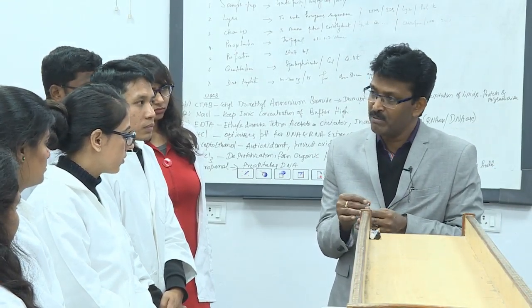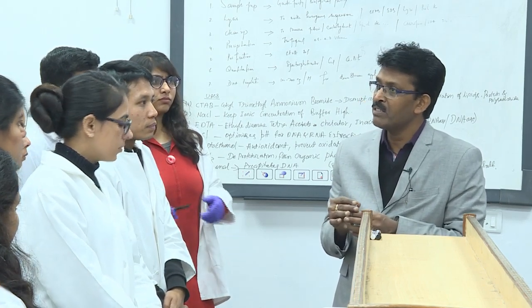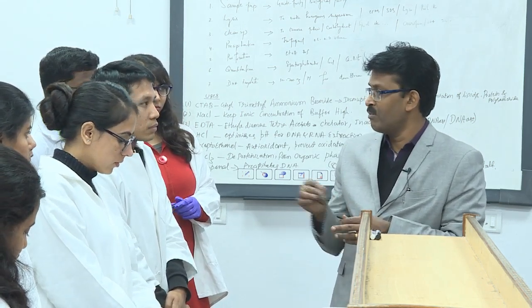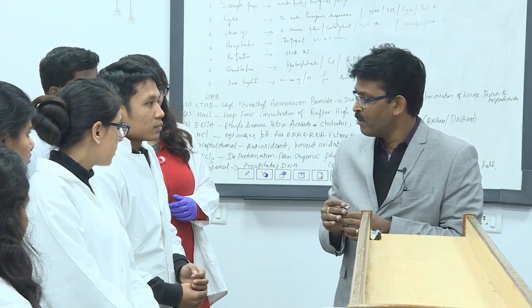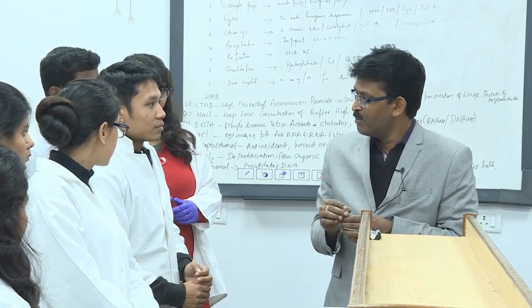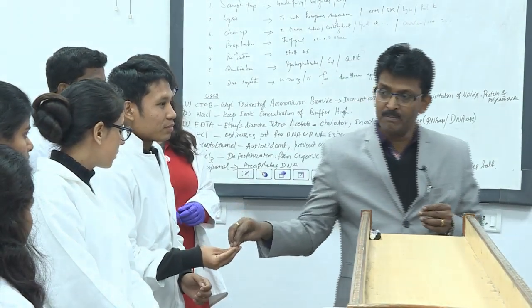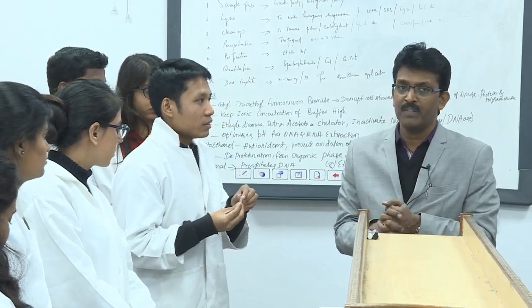Okay. Now, you proceed with the PCR. For the Bacillus group, you are going to amplify 16S ribosomal DNA, and now you set up the PCR. Okay. Anybody has done it, or you need proper mentoring for that? No, sir. You will do it? Yeah. Where are the chemicals? Yeah, fine.